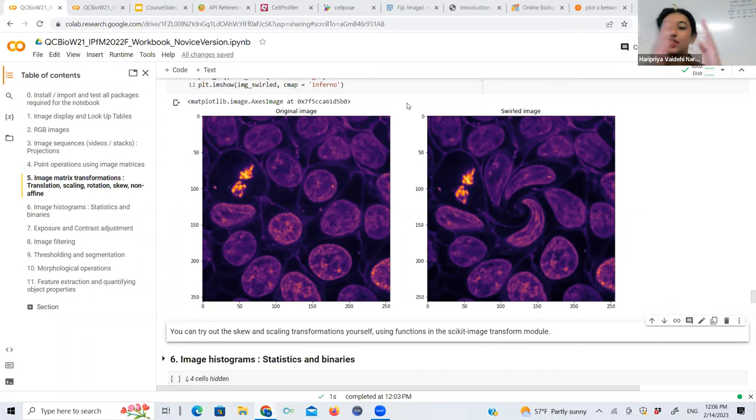So the standard deviation gives you the spread. It's kind of like you're getting from the brightest to the dimmest. So for example, if you want to see what is the range of noise that I'm getting on a particular image, you can go for the standard deviation.